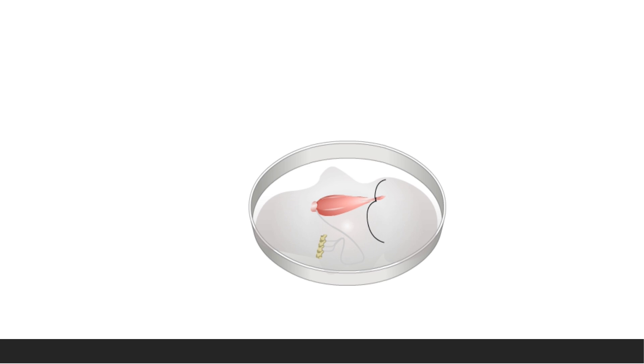Cut the knee joint, remove the redundant muscle, and place the nerve-muscle preparation on a Petri dish and dip it into the frog's Ringer solution. Your nerve-muscle preparation is now ready — stunning, pithing, and dissection are complete.